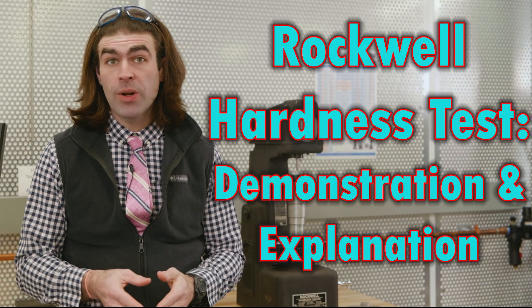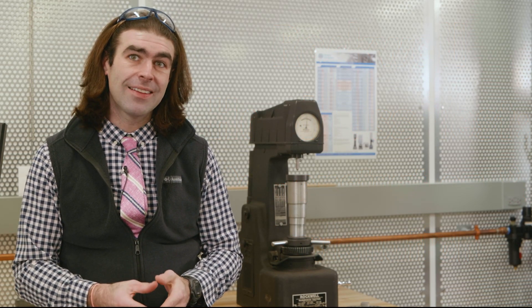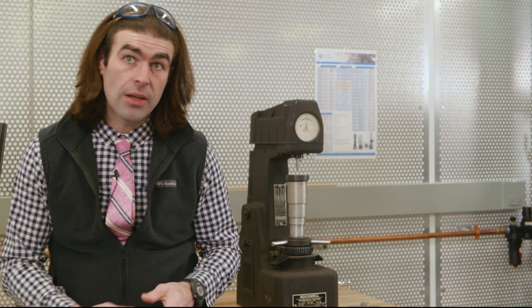In this video I'm going to demonstrate how to use a manual Rockwell tester, then talk about how it works and some of the different Rockwell tests that are available. Let's dive right in to how to actually use it.